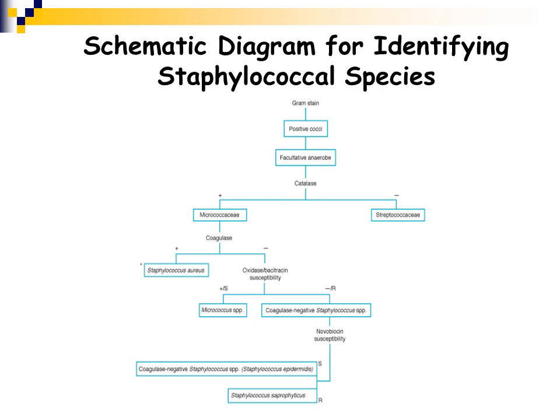So the bacitracin susceptibility test is done exactly like a Novobiocin susceptibility test, but the disc would have bacitracin on it. Oxidase is a test that's more commonly done on gram-negative organisms.